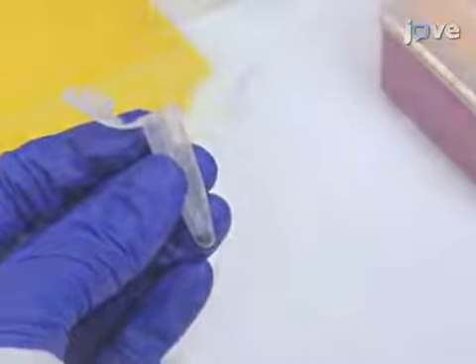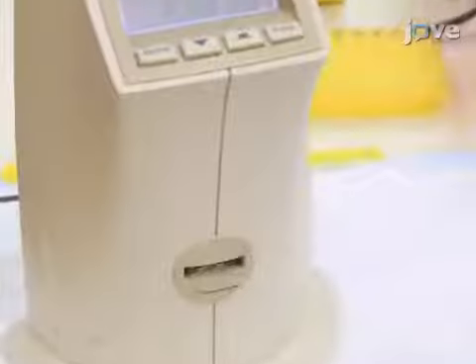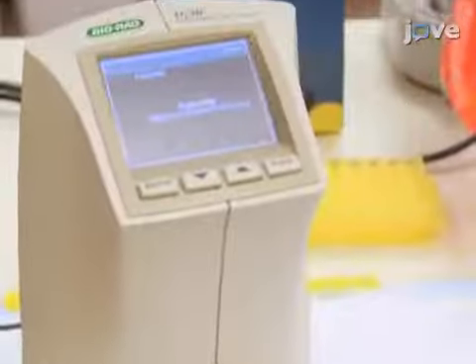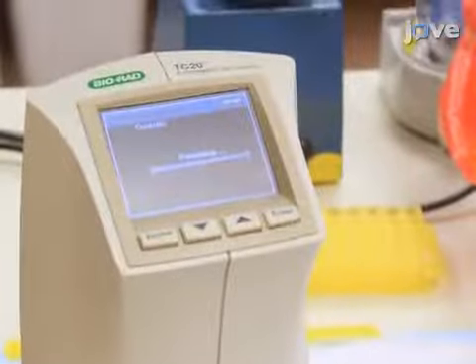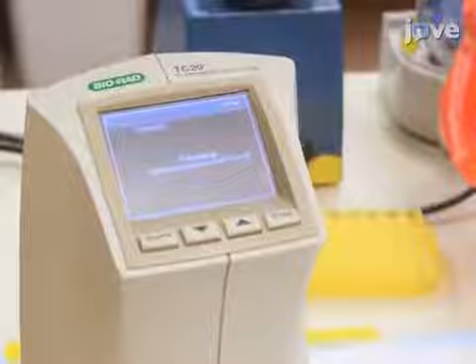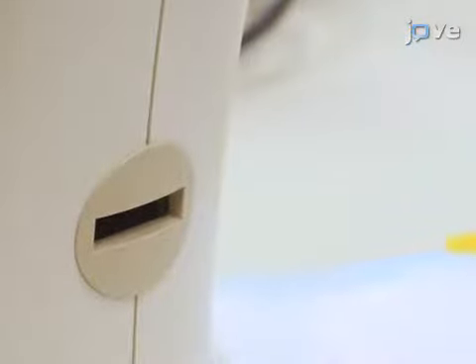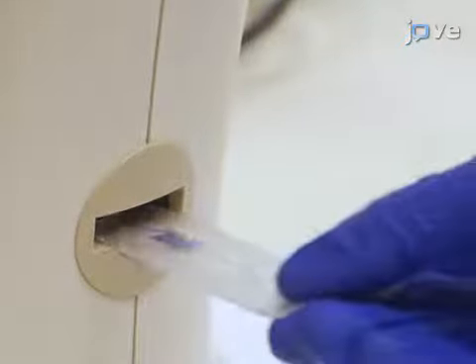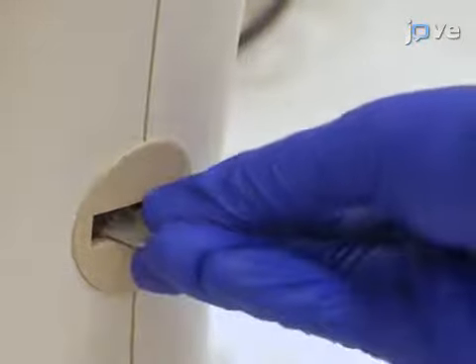Pipette 10 microliters of the solution into a cell counting slide and insert the slide into an automated cell counter. Repeat the cell count at least three times or until obtained counts are consistent.